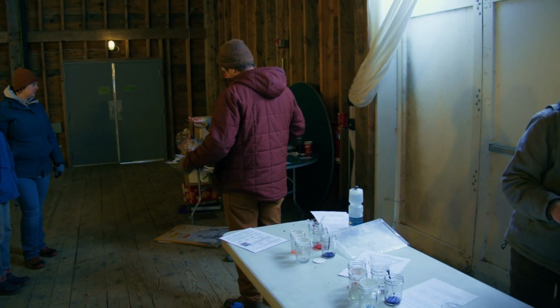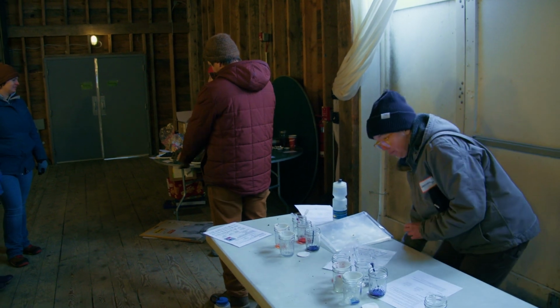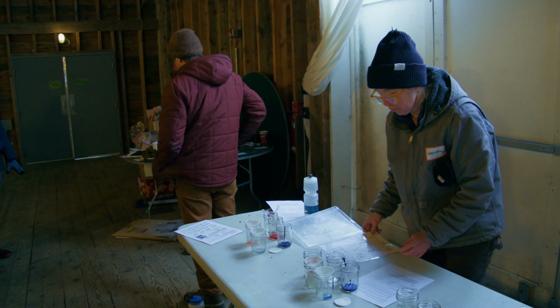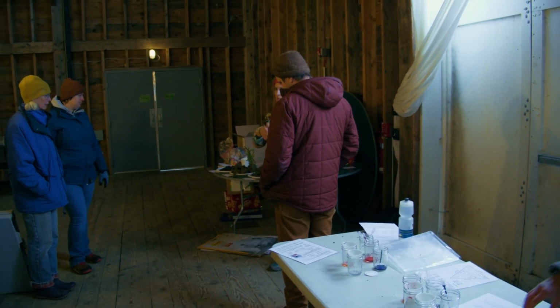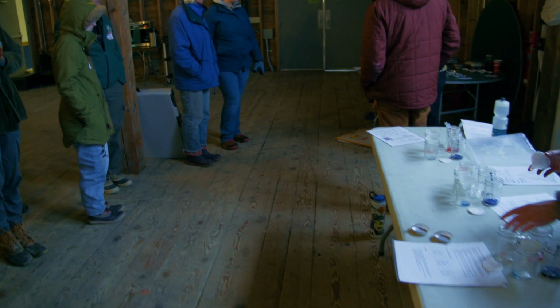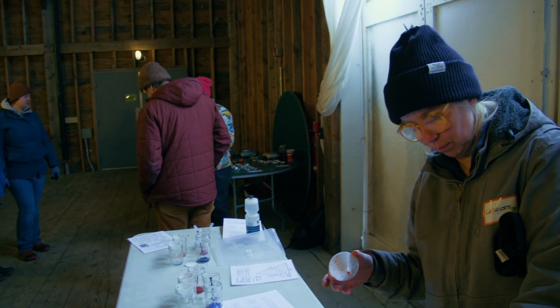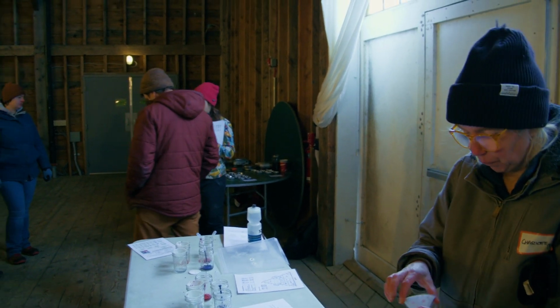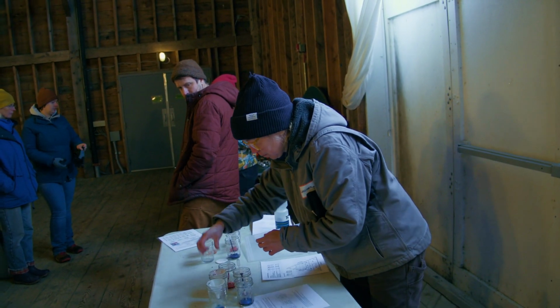If you're wearing gloves, I'm very sorry. You'll have to remove them for this activity. You're going to grab the corresponding soil, just a handful from the plate. Then if you come back over to your station, we'll have instructions for both doing the texture, a method where you can determine the texture just by feeling it, and then a super fun chemistry activity to look at the CEC and AEC.